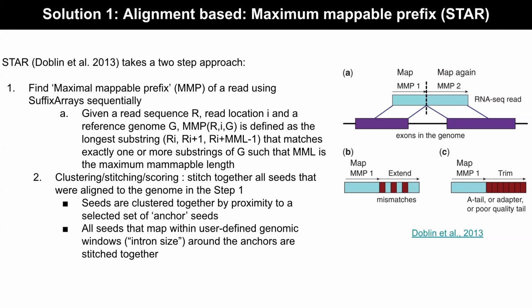But the idea is that they looked at multiple different donors. So they took RNA-seq: patient 1, patient 2, patient 3, did RNA-seq. They did RNA-seq for all of these. And then they did what's called de novo assembly, which is you start from the RNA sequence and you start to put together what the isoform structure would look like.